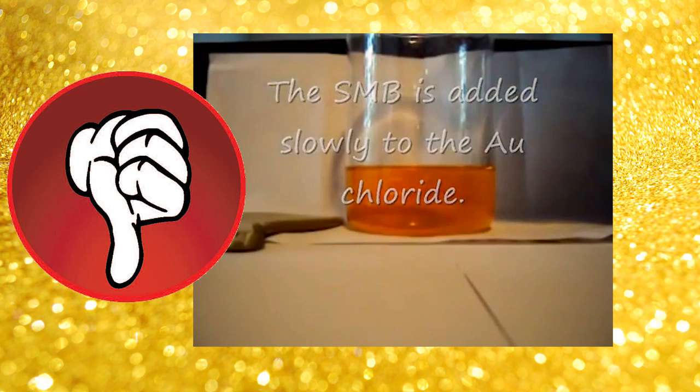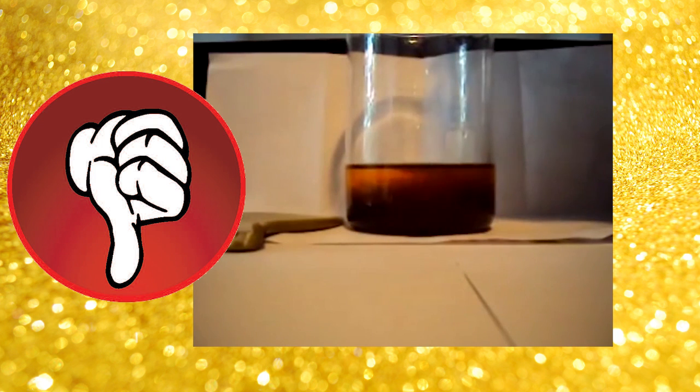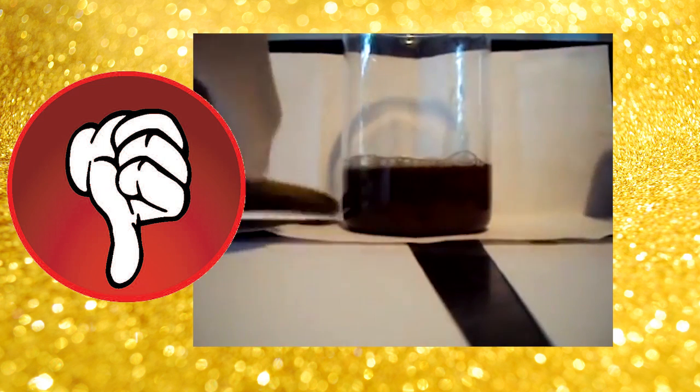On this video, it is also done a bit wrongly, but not completely wrong. As you can see, nitric acid is neutralized, the solution is very concentrated, and yes, gold will precipitate. The only thing is he did not dissolve SMB in water first.